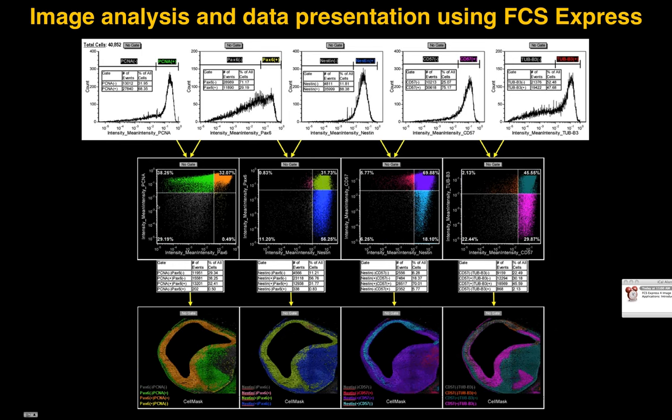Notice I use the log scale because that allows me to plot very low events and very high events all in the same plot, as well as getting some sort of a Gaussian distribution, which is a population base that you would see on a flow cytometric analysis on a histogram with a log scale.